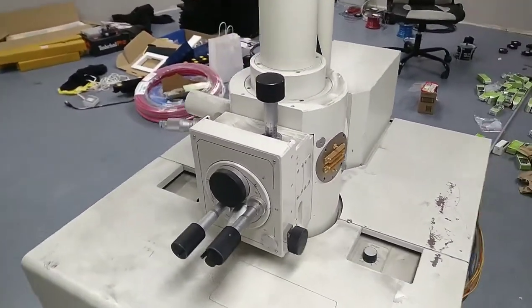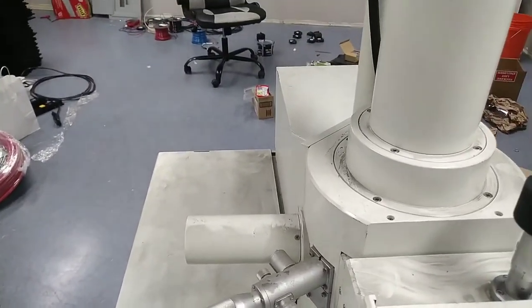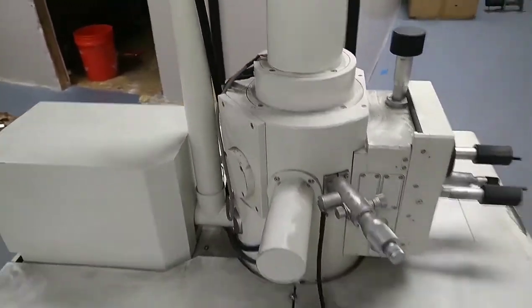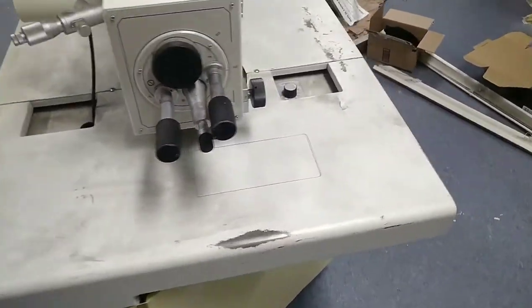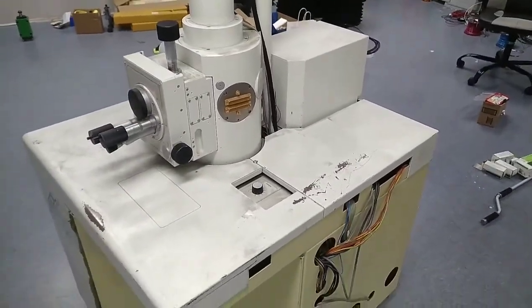It might actually have a second stage here for viewing things that can move in multiple orientations. So what I'm going to do right now is probably pull the covers off of everything, and then we'll see what circuitry we have to work with inside of there.